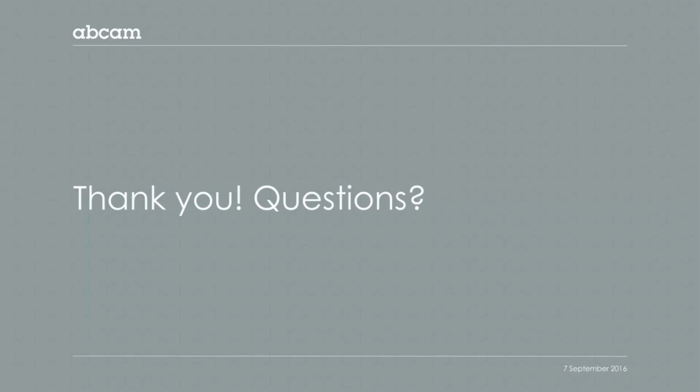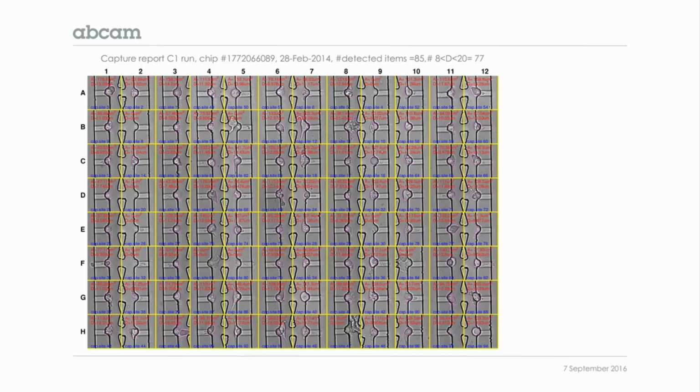Yes. So again, in this study, what I described is basically the use of the Fluidigm platform. The Fluidigm platform is a microfluidics platform where the cells are flowing in a channel, and this channel has, I will try to highlight, I don't know if people see this, a capture site.